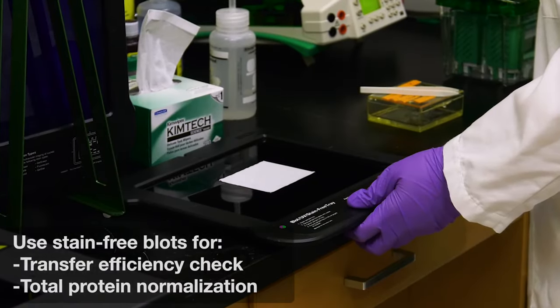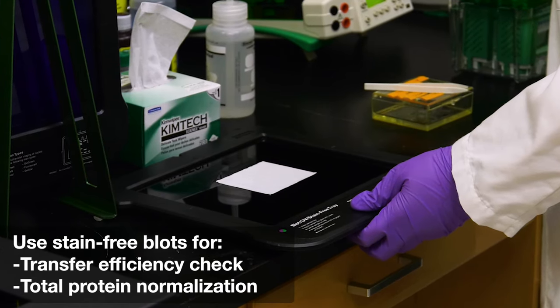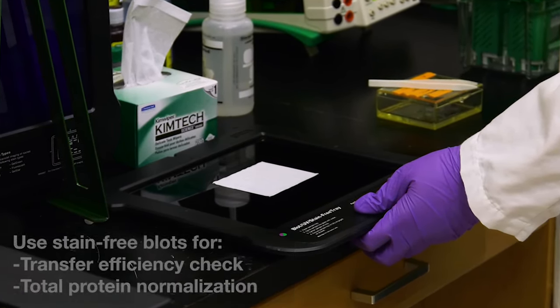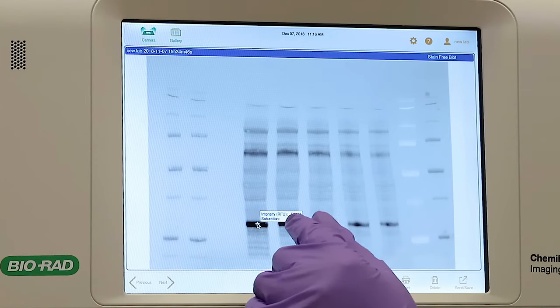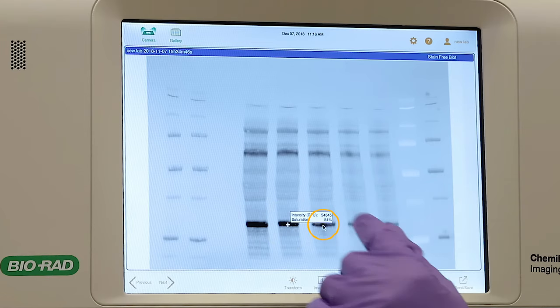If blotting, stain-free gels can be visualized on the membrane and serves as both an effective transfer efficiency check and total protein stain. For a rapid look at the band intensities, you can tap each band and the relative fluorescence units as well as percentage saturation will appear.